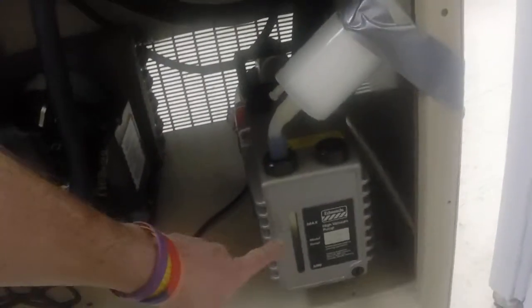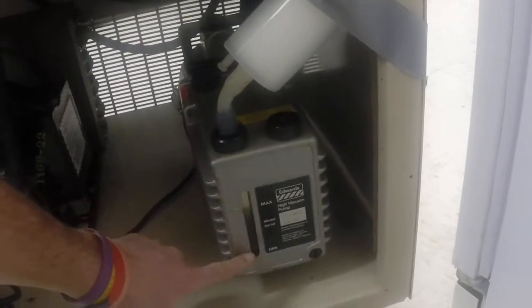Before you turn on the vacuum pump, you should check the vacuum pump oil. It's on wheels so it can come out. If you tip it a little bit you can see the pump oil — this is the maximum and this is the minimum value here in the back of the unit.